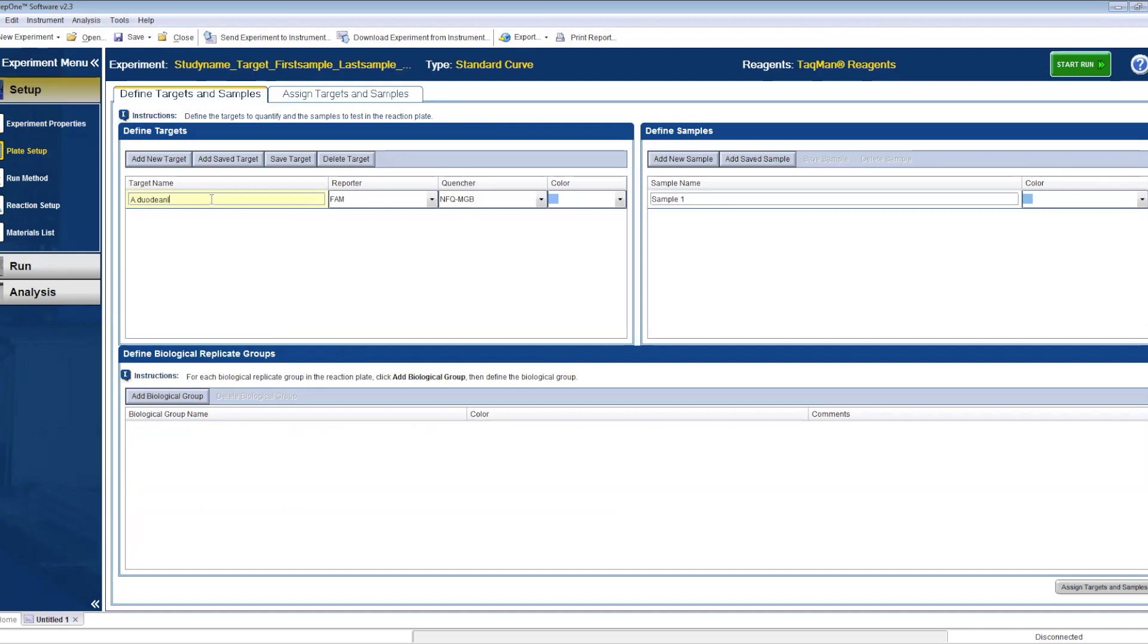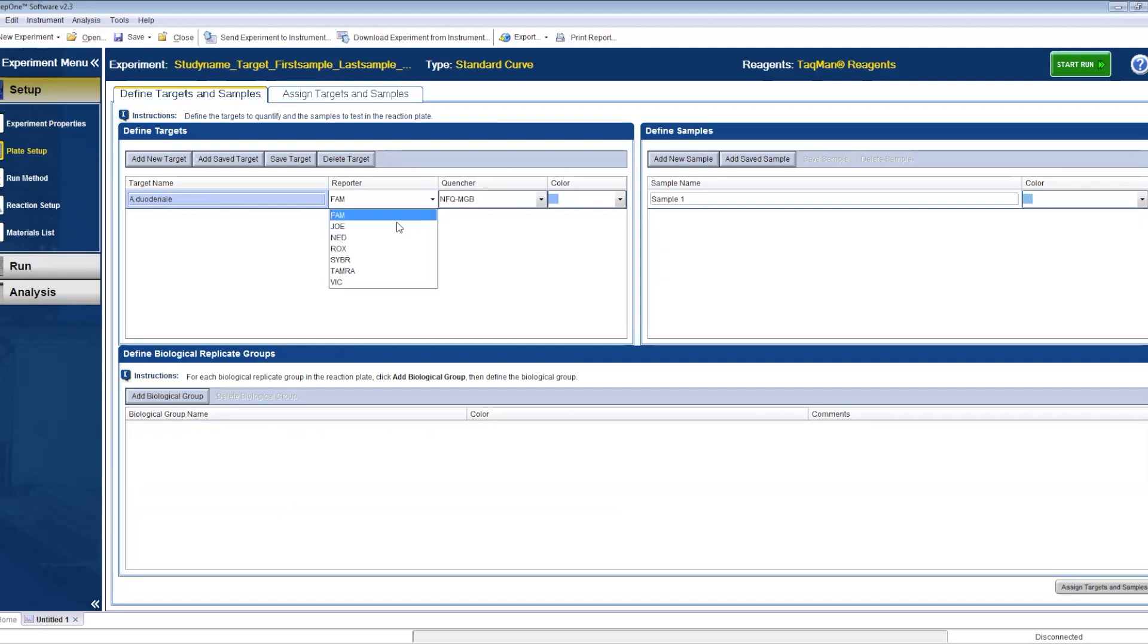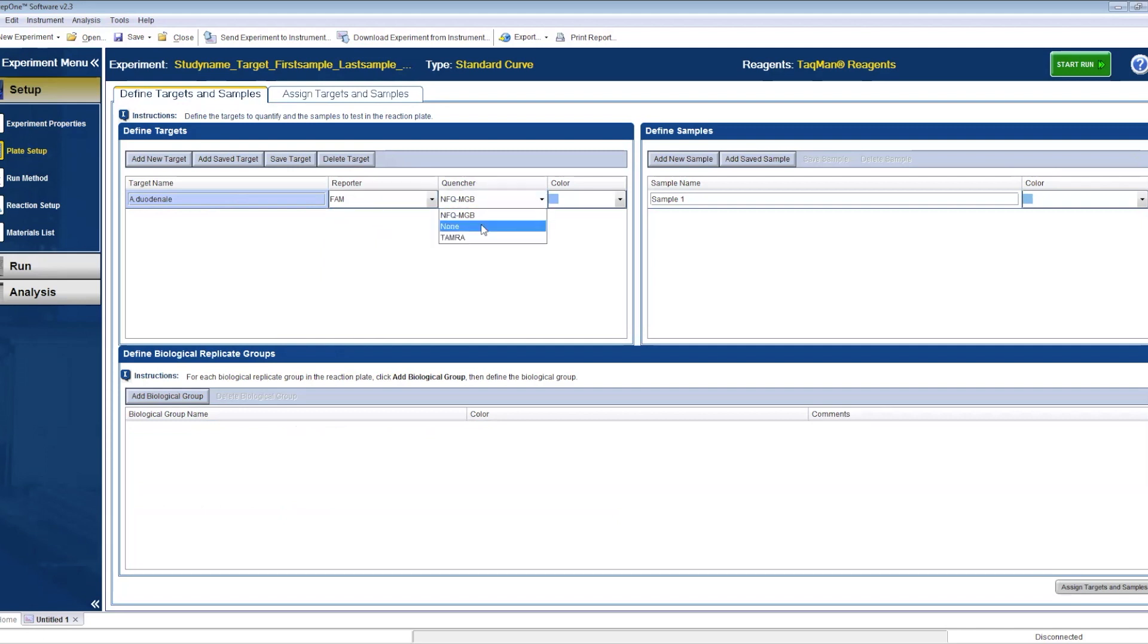Now for the plate setup. First up, define the targets and samples. Type the name of the assay and choose the right reporter and choose none if there is no quencher. For all the STHs and the control included, use FAM as a dye and none as the quencher. Then you need to define the samples 1 to 39, the DNA standard concentrations, and the non-template control in this instance.